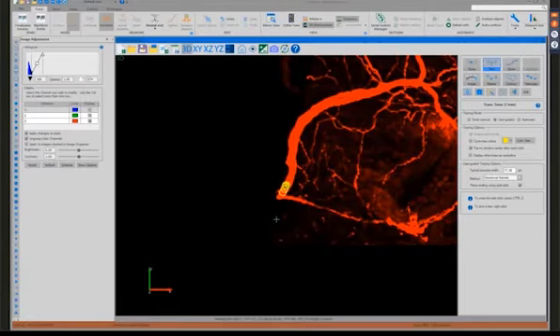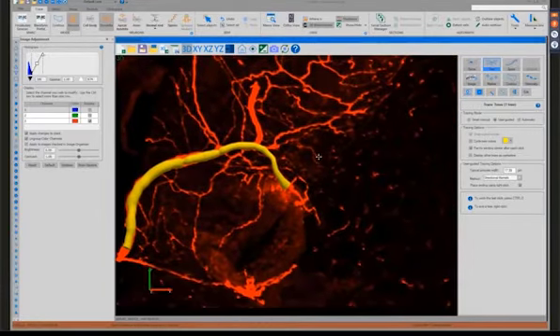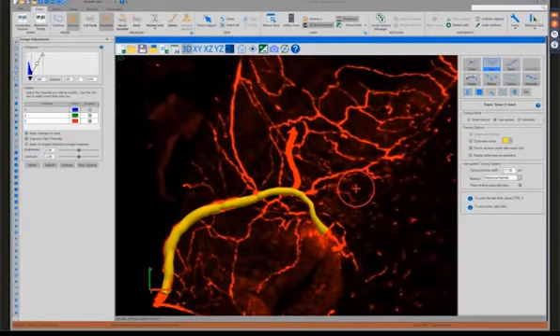And next, really easily, without clicking down on the image, I'm just hovering my mouse in the direction of where the process goes. It will render more circles, again matching the diameter of the process. And when I'm happy, I will click down and it will fully render that tree in 3D space. I can trace in any direction, which is really nice.